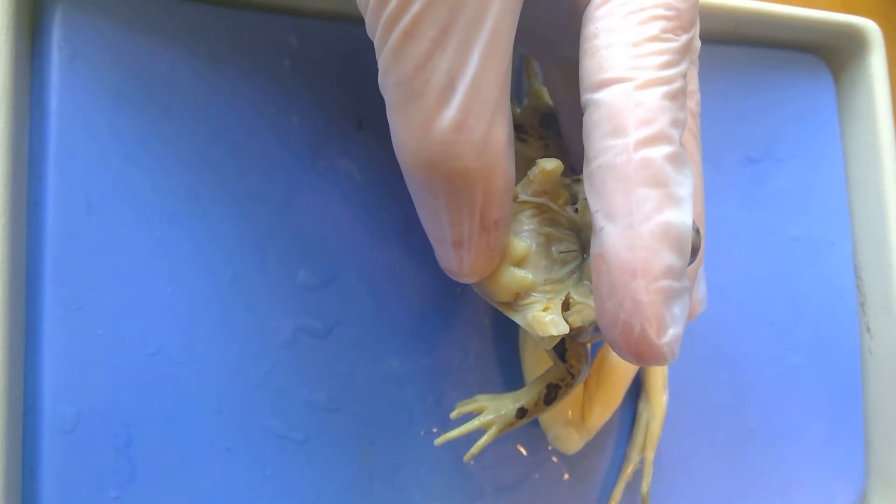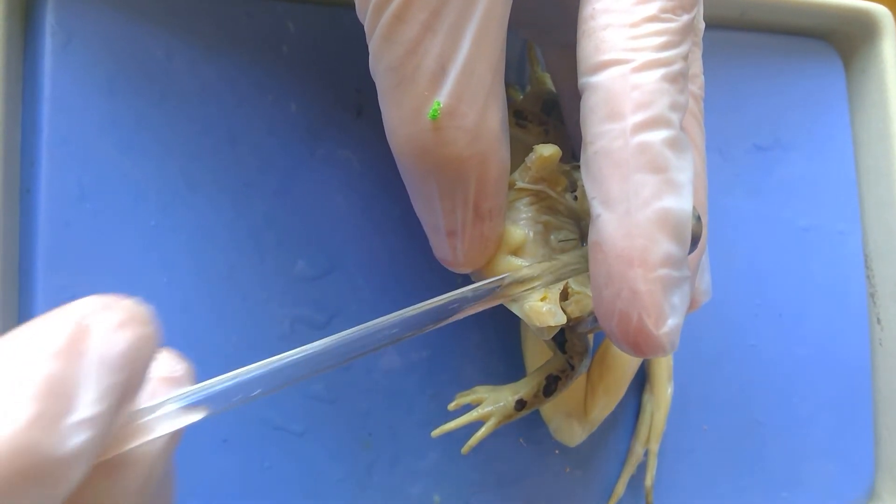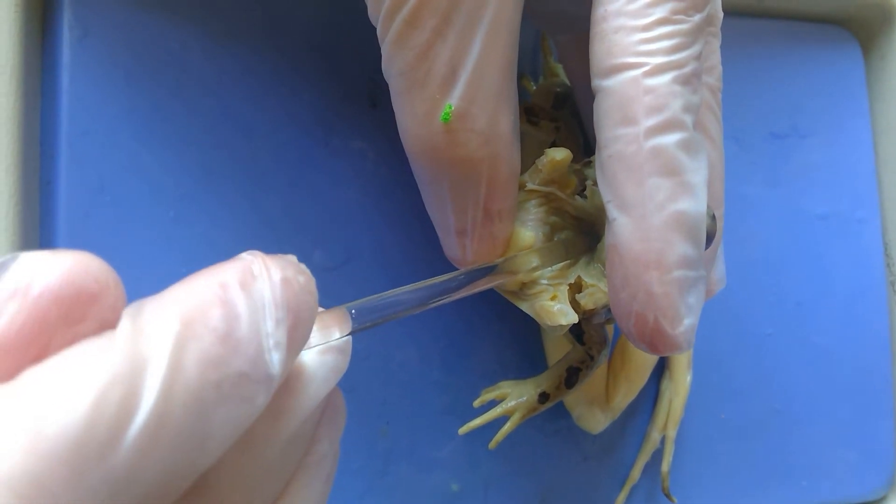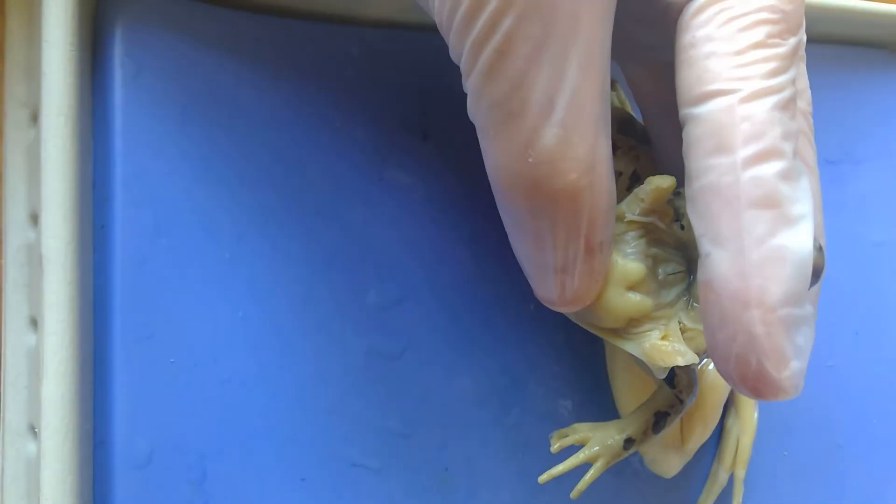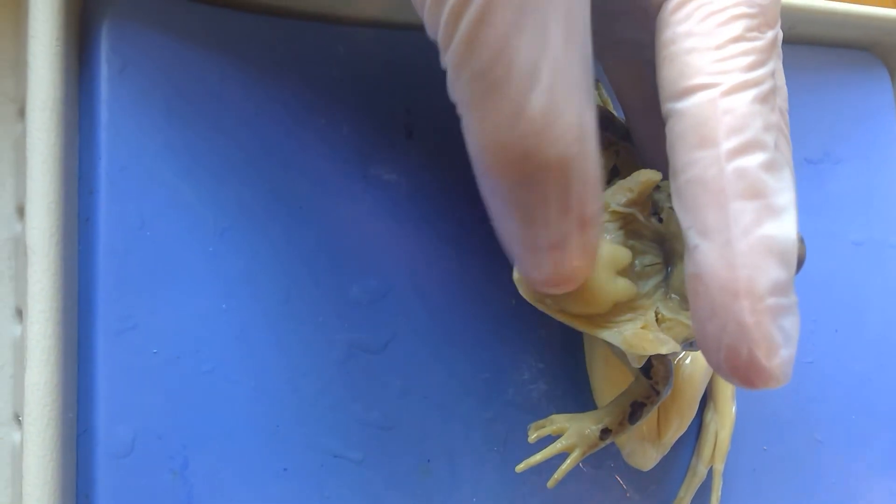And then this one right here is called the gullet. And it can open up pretty wide. So, that should give you a clue as to which one it uses to swallow food and which one it uses to breathe air.